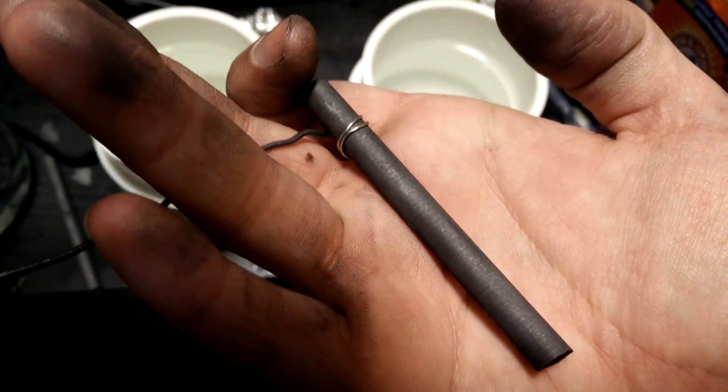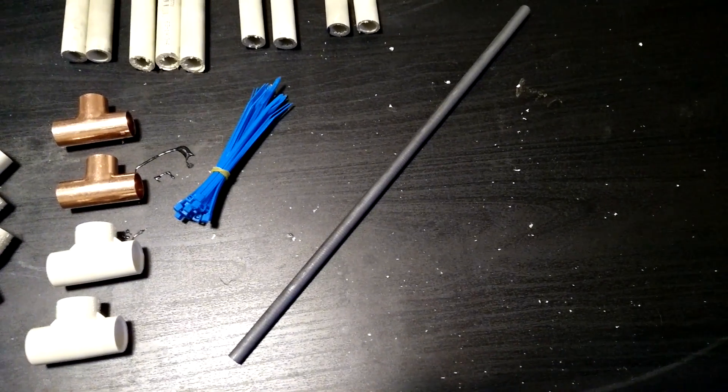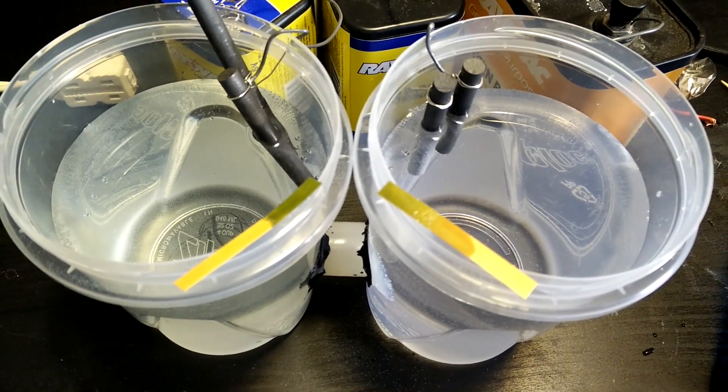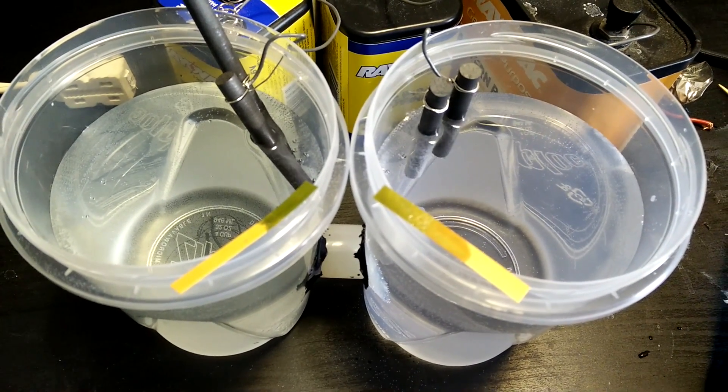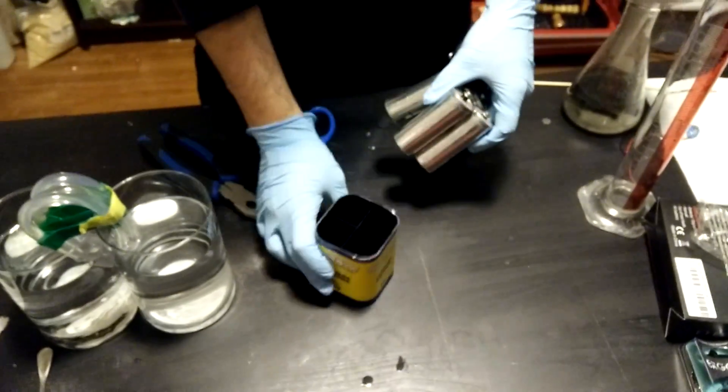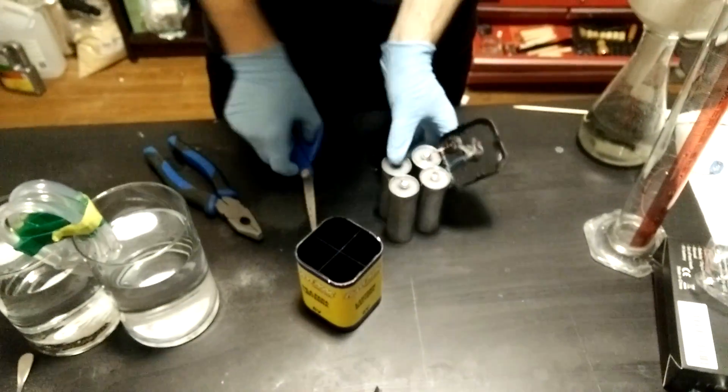The next thing you'll need are electrodes. You have a few options here but some are better than others. In my final cell I used graphite rods I ordered online for a few bucks, and they work pretty well and actually hold up even in the corrosive liquid. If you don't want to order stuff online and have an old lantern battery lying around you can salvage the carbon rods from it.